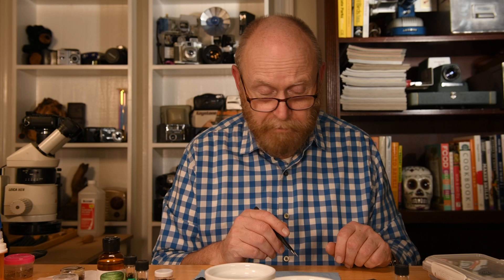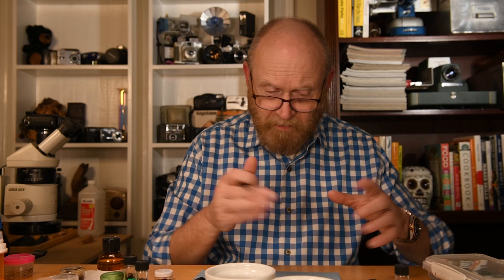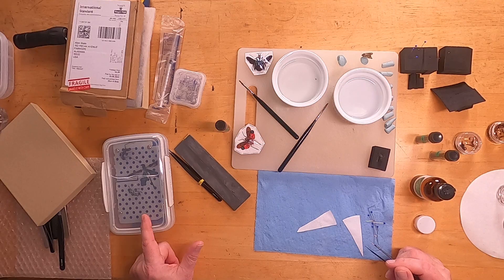Keep it in a room-temperature dark place — don't leave it in direct sunlight, it'll get too hot and you'll steam your insects. All you want is to let the moisture in the air equilibrate inside the appendages. Every now and again open the box and wiggle an appendage — is it starting to get loose? If it is, you're almost there. Don't let the whole thing get flaccid and floppy, because that's too far, and then once it gets floppy it'll fall apart.